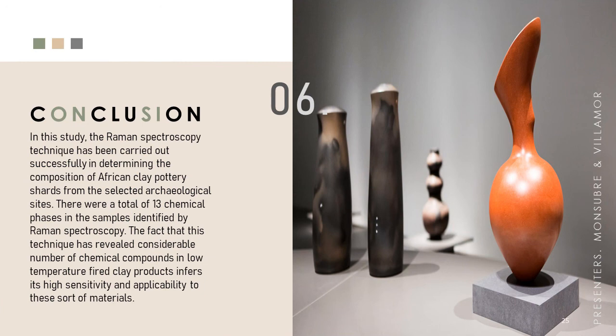The commonality in features of the representative shards was observed. Hence, the clay minerals in the pottery making process employed for these materials might not have varied significantly within the said region. Overall, through this study, Raman spectroscopy has demonstrated a significant ability in detecting various chemical species in low-fired clay products, implying its functionality in determining the raw materials utilized, processing conditions, and discrimination based on the unique chemical compounds.